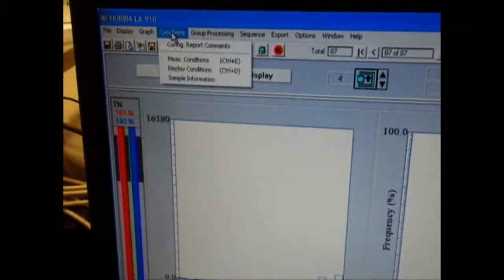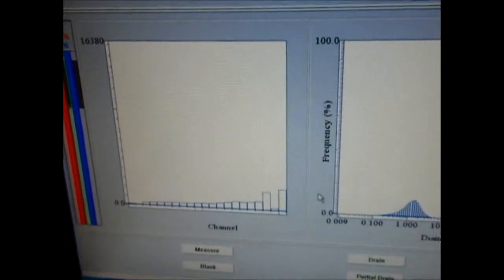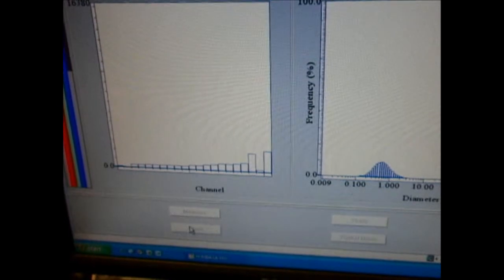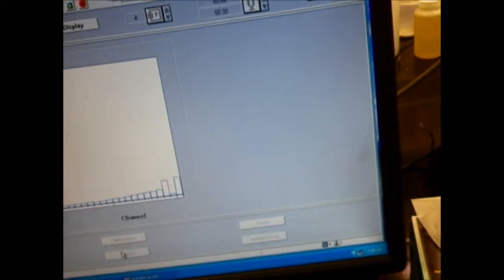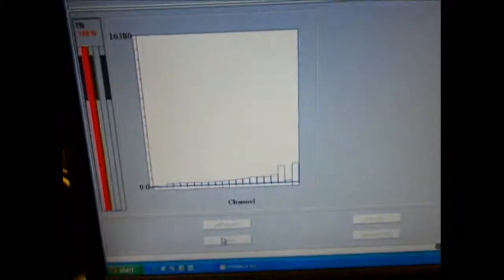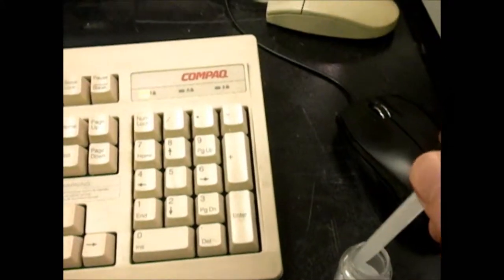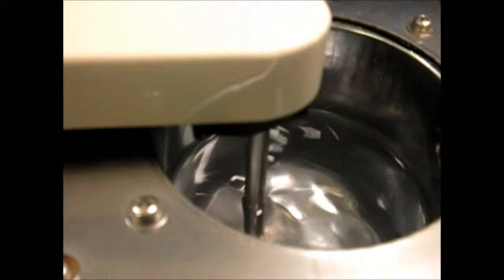I'm going to go into conditions and call the sample name 'product.' Once I start agitation, I may have to take a second blank, so that's exactly what I'm going to do. When this blank is done, I'm going to put the predispersed sample into the circulation bath using a transfer pipette, and pour the sample in.